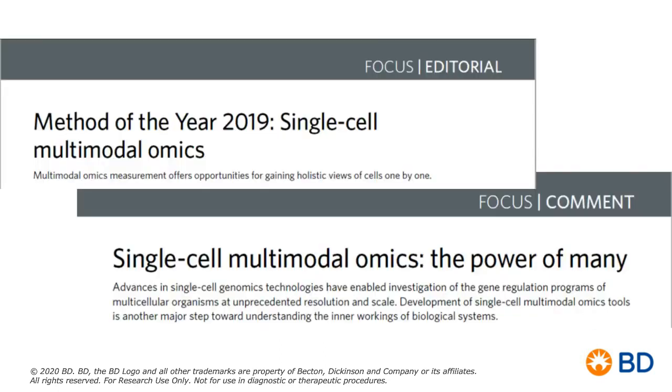As many of us on this webinar today are immunologists or are in the field of immunology, we probably have a significant appreciation for the value of single-cell multiomics. The ability to get complex and comprehensive data from single cells and also be able to apply that across a large population was highlighted as the method of the year in 2019 by Nature Methods. And as we look in the literature and as we all move forward in the experiments that we're doing, we're all becoming very much aware of how much information we can actually gain by integrating all of these technologies.